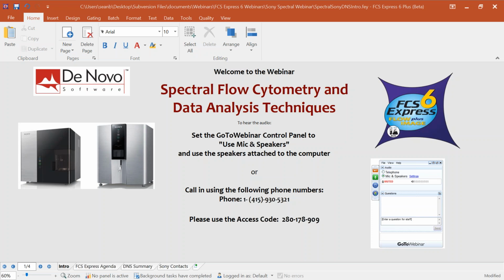But today for the agenda, Greg is going to be giving us a presentation and an overview of the Sony Spectral technology and some of the software on his side. Then halfway through the webinar, we're going to switch over and start taking a look at some of the data analysis techniques directly within FCS Express with some of the same data. So at this point, I'm going to flip the presentation over to Greg.